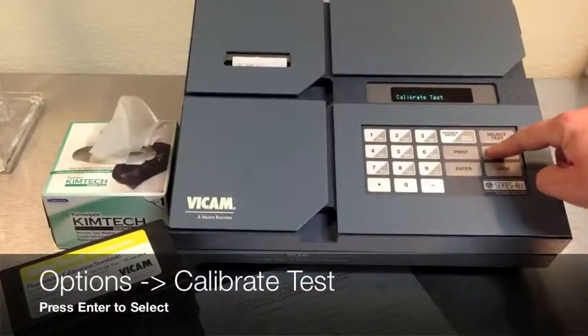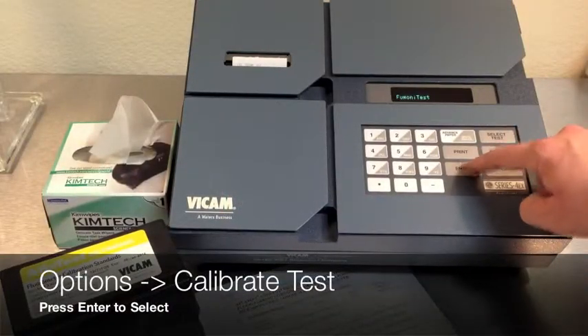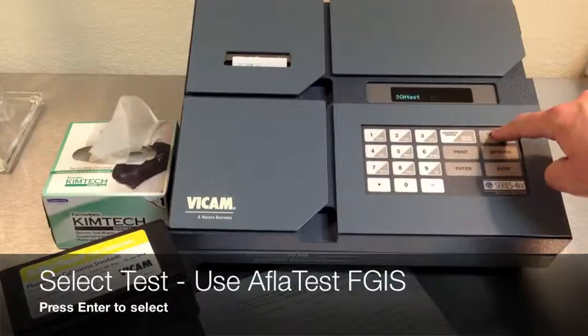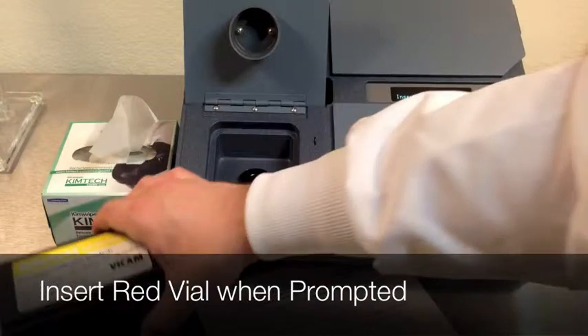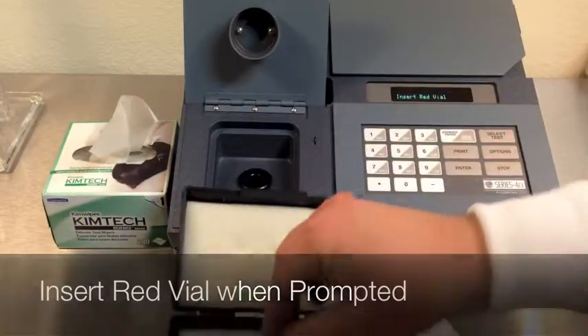Turn on your fluorometer, press options and select calibrate test. Press enter to accept. Press select test to choose AFLITEST FGIS and press enter to accept.